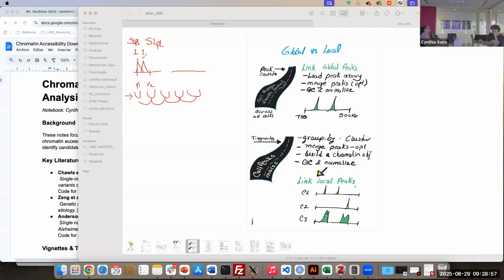So we cannot infer cell type specific interactions between peaks and genes, because of the way the data is integrated when we are using default values in the CellRanger-ARC pipeline.